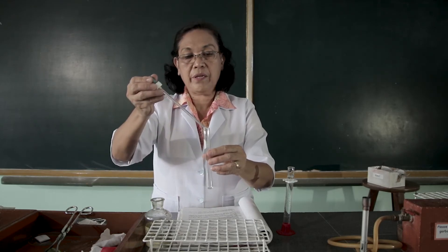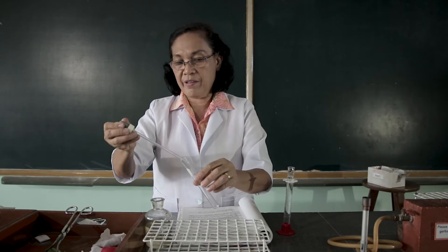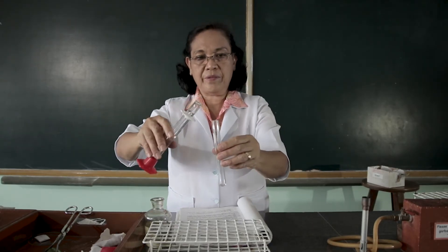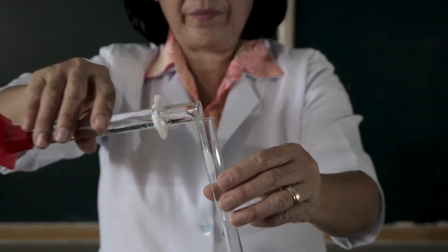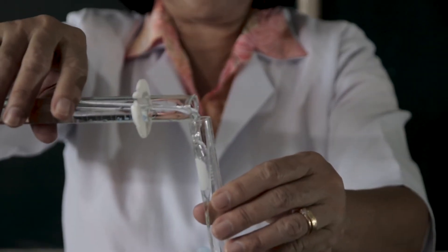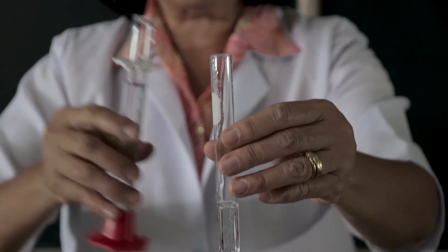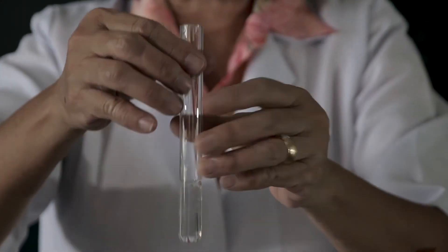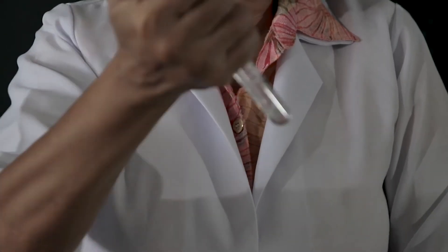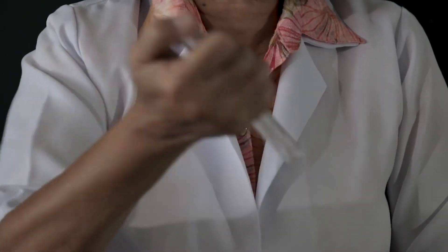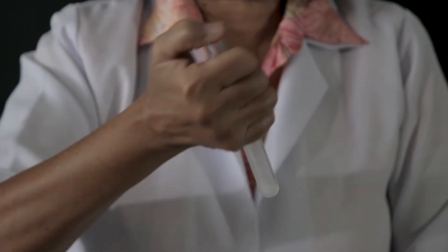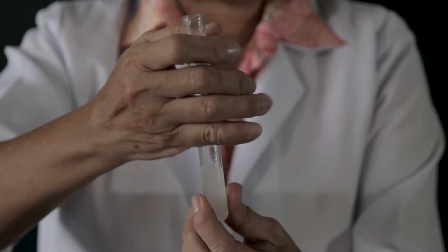Let's get five drops of the coconut oil and we are going to dissolve this with water. One, two, three, four, five. Then let's add this with water. Let's shake it and observe what happens.